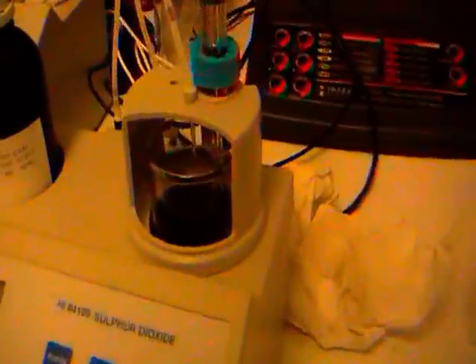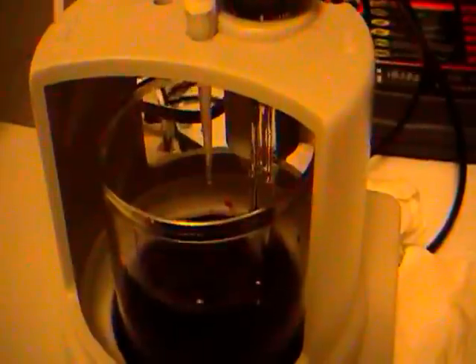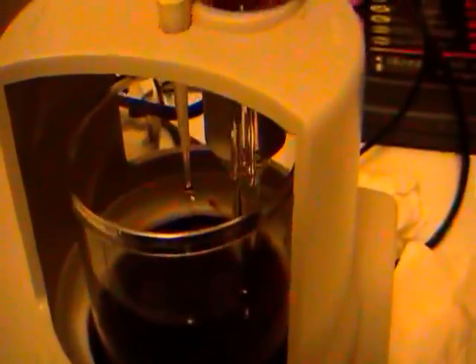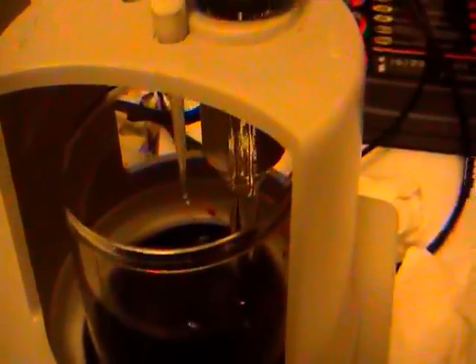So we insert our probe into the machine here, and we put our doser in, and we hit start. And as you can see, the pump is now dropping. The color changes a bit. And here we are.